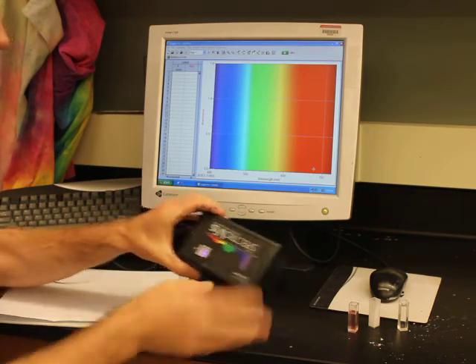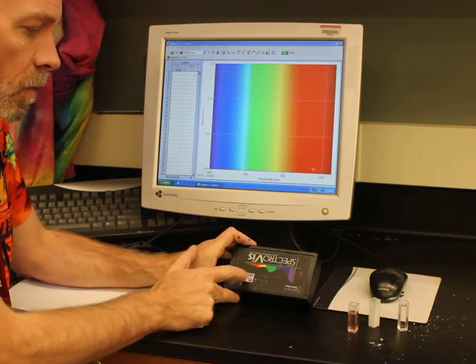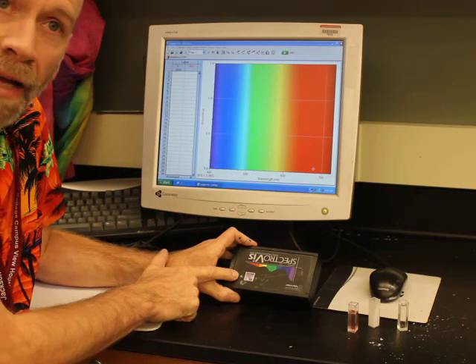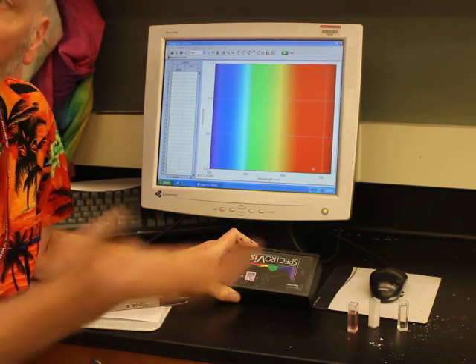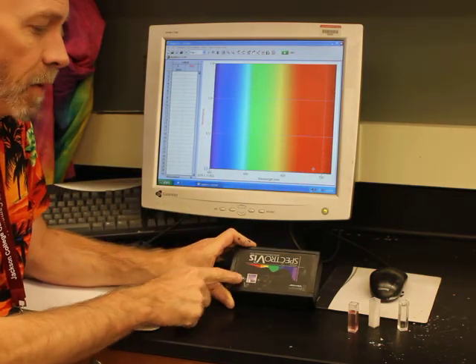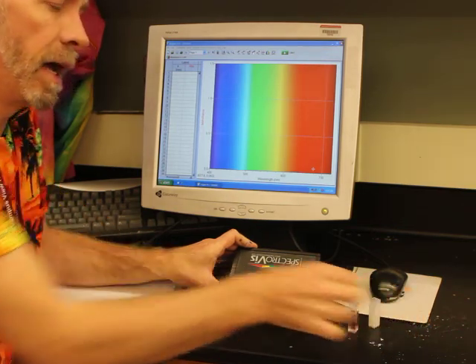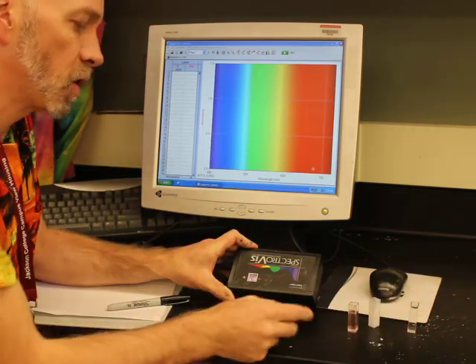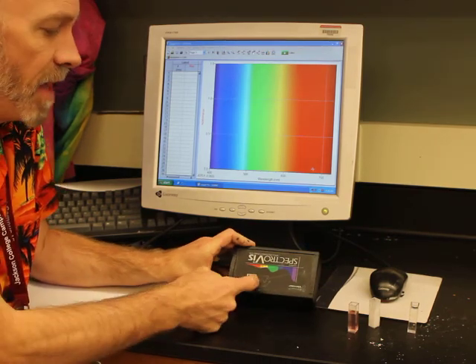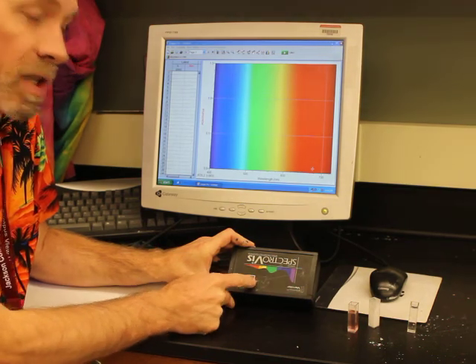What we have is a box that has a couple of different parts. On one side, we have this square hole, and on one side we have a light, and that light is giving off basically an entire rainbow of colors. Then the light passes through our square hole into, we put a square peg, right? Our square peg then absorbs some of that radiation, and then some of the light passes through our sample and goes to the other side.